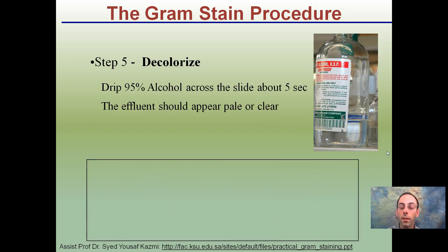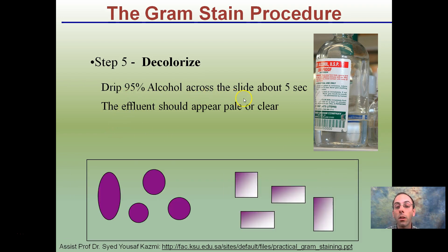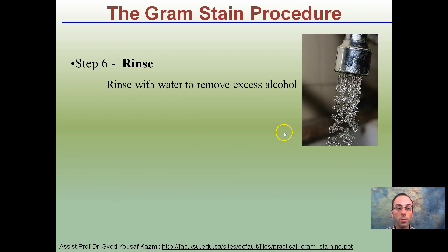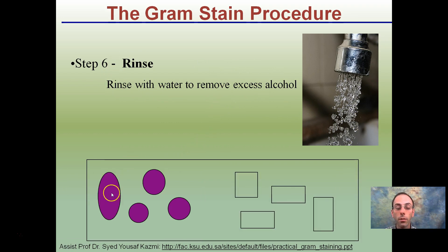Step five is to decolorize. This is an important step. Drip 95% alcohol across the entire slide for only about five seconds. This will decolorize the cells that aren't holding onto the stain very strongly — you can notice those become a lighter purple while others remain a strong purple. If you let it sit too long, it will decolorize all the cells, so not only are the steps important but also the timing. Then rinse to remove all excess alcohol, which leaves us with the purple cells and the now-decolorized cells.